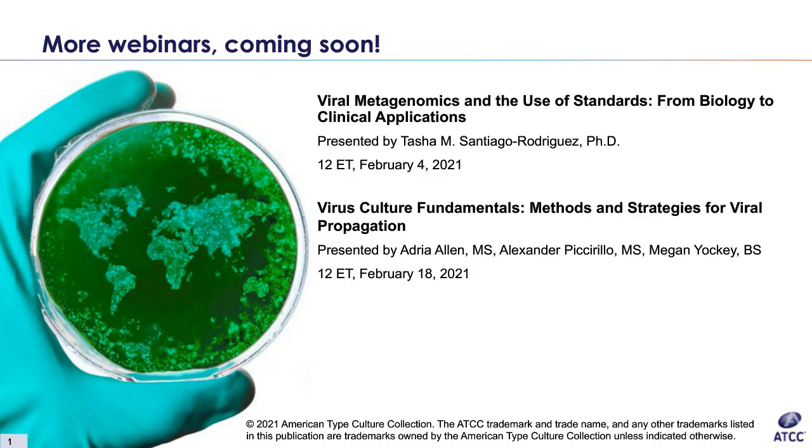As far as other experiments where you have a healthy culture and then you're reseeding it into new flasks in preparation for further experiments, you would probably want to judge by how high of a confluence you need for those experiments, what level of growth you would want to see. But in general, just immediately after thawing the cells, I would not recommend starting 24 hours after, because it seems like there may be some more time that is needed for the cells to actually revive from cryopreservation.